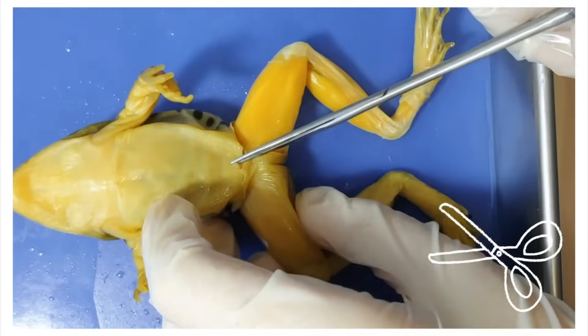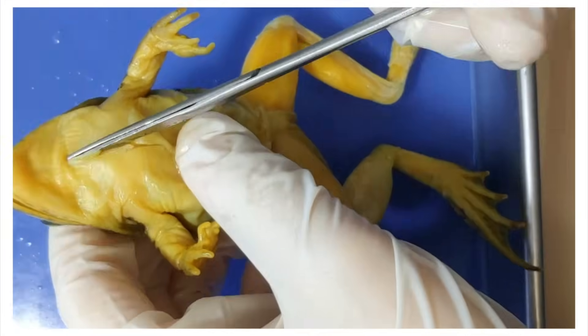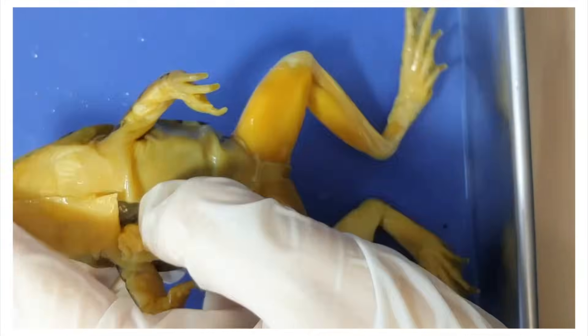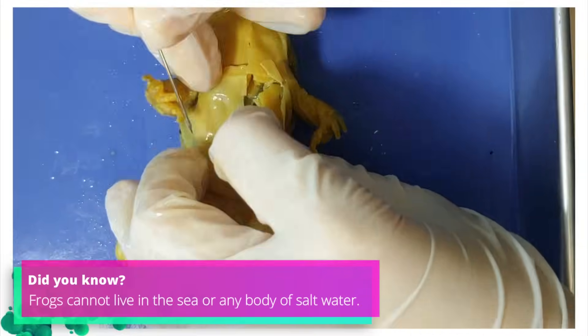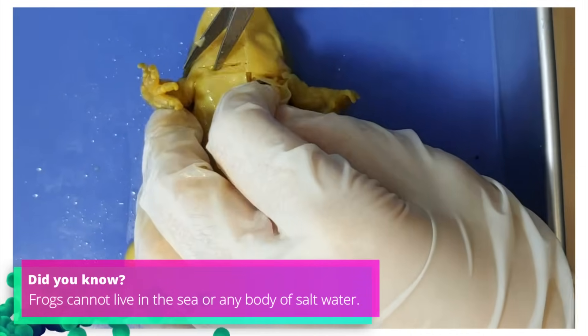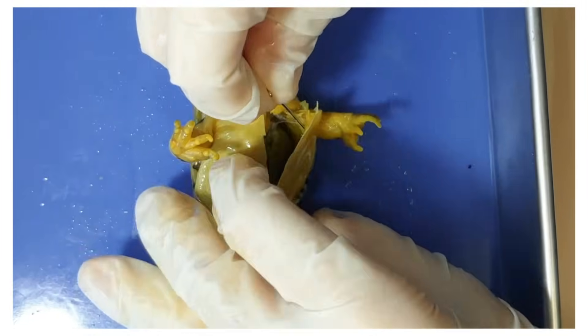Now I'll open up the torso. To do that, I'll cut through the skin and the muscle right underneath, and cut horizontally around the arm, neck, and stomach. Now I'm going to pin down the flaps.